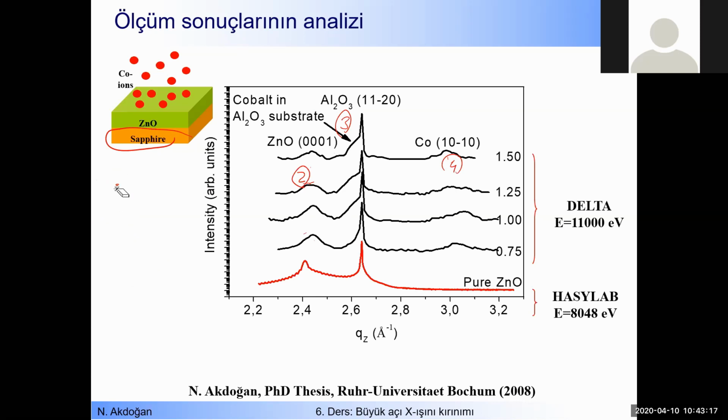How about when we think about the hexagonal structure? You draw the bigger atom upside, and how, let's say, do we change the zinc atom at the bottom line.